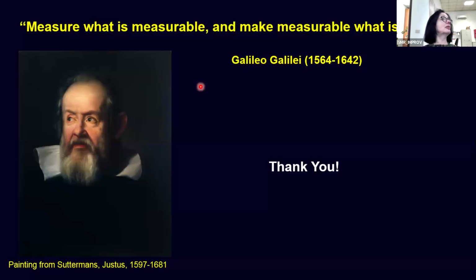So I want to access the dimensionality of the motion by applying a specific model, and this is not information which I get by other methods. If we had a recipe from other methods for everything, we would not need relaxometry. And we still argue that this is quite a unique method.